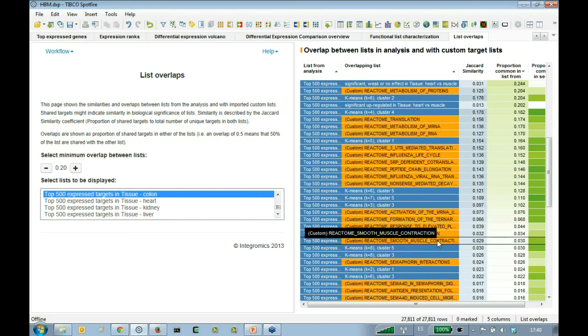Of course, in this case, because this data set, we know what we expect, this is not such a surprise, but if you had a set of genes that you had identified in a previous study, or several different pathways that you have identified that are altered in a different study, you can easily, just with a few clicks, run your data through this exploration tool and get all this information in a few minutes.